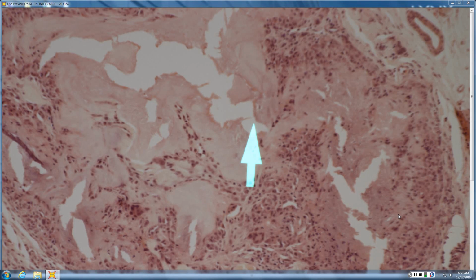So do you remember what they talk about with urate crystals, how you recognize them? Yeah, I'm trying to remember which one it is. They're needle-shaped, negatively birefringent. So everybody says that, and that's great and all, but what does that actually mean? When you put the polarizer parallel, they're yellow, and if it's perpendicular, they're blue, because some crystals are birefringent and are the opposite.